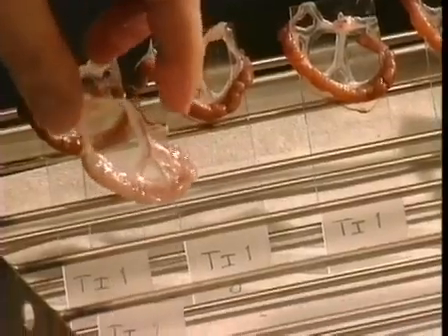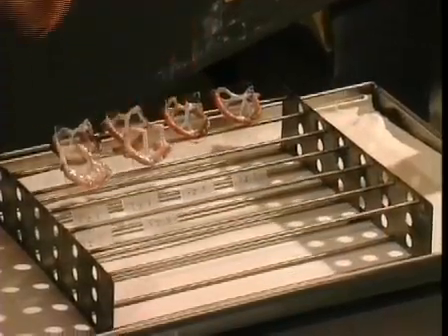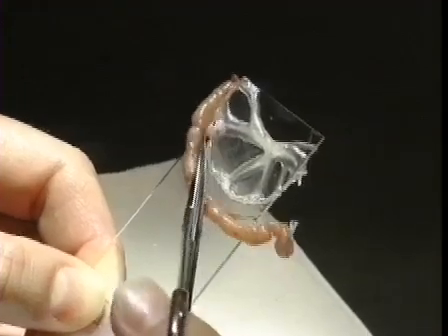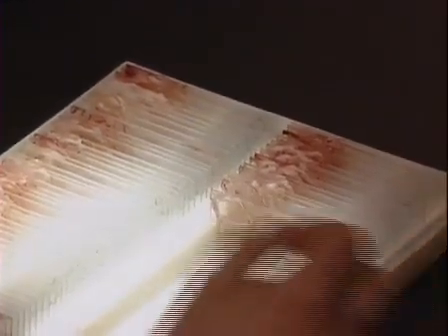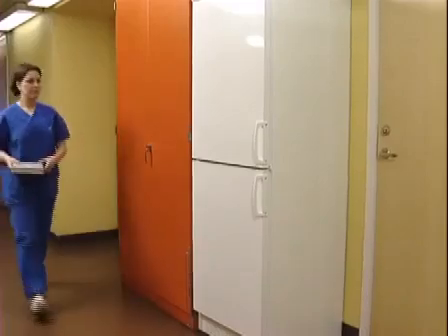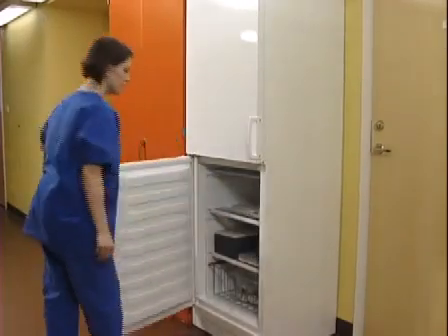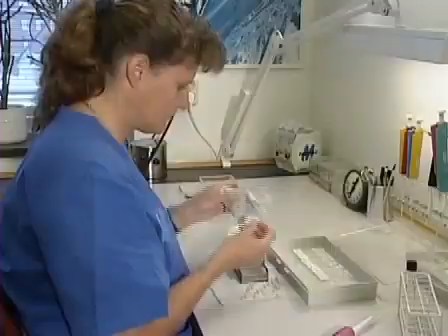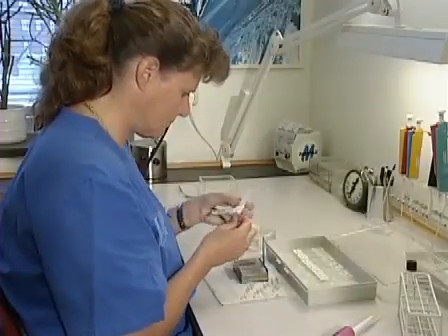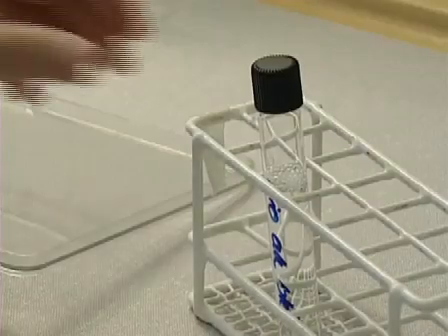The specimen on the slide is dried at room temperature for 20 minutes. The intestinal stump is cut off. The specimens are then kept in a freezer at -20 centigrade. In this way, the specimens can be kept for several months, perhaps even years, without any pronounced deterioration in quality. Staining is done using a monoclonal antibody against rat endothelium.